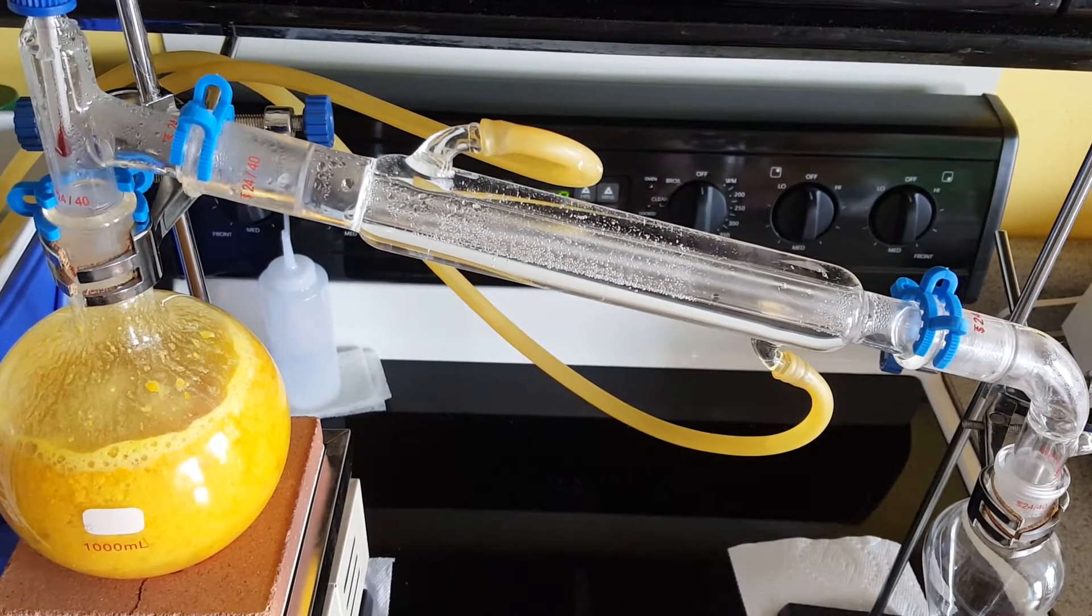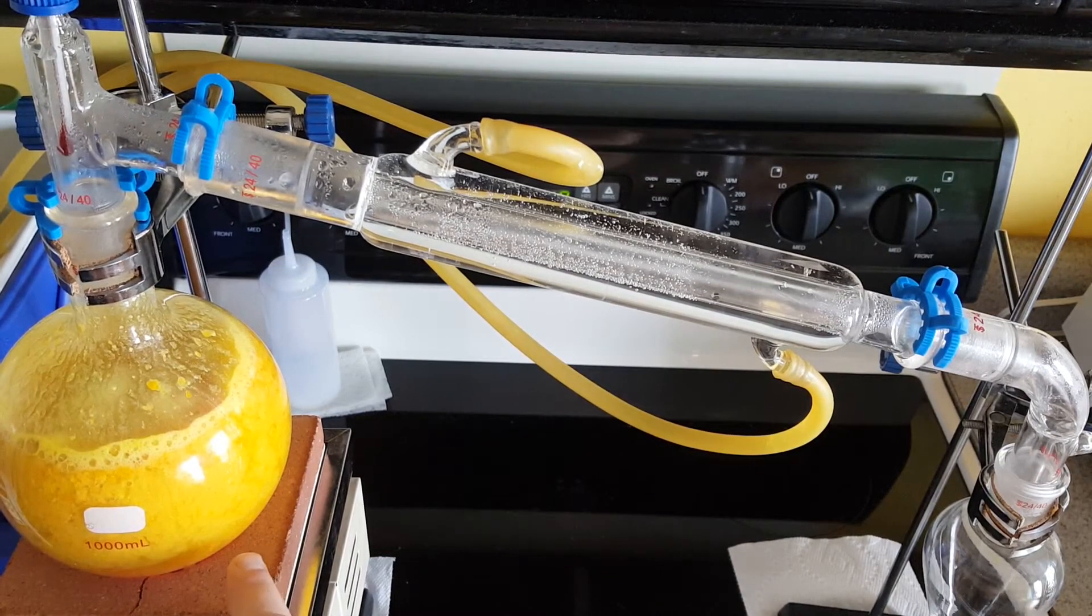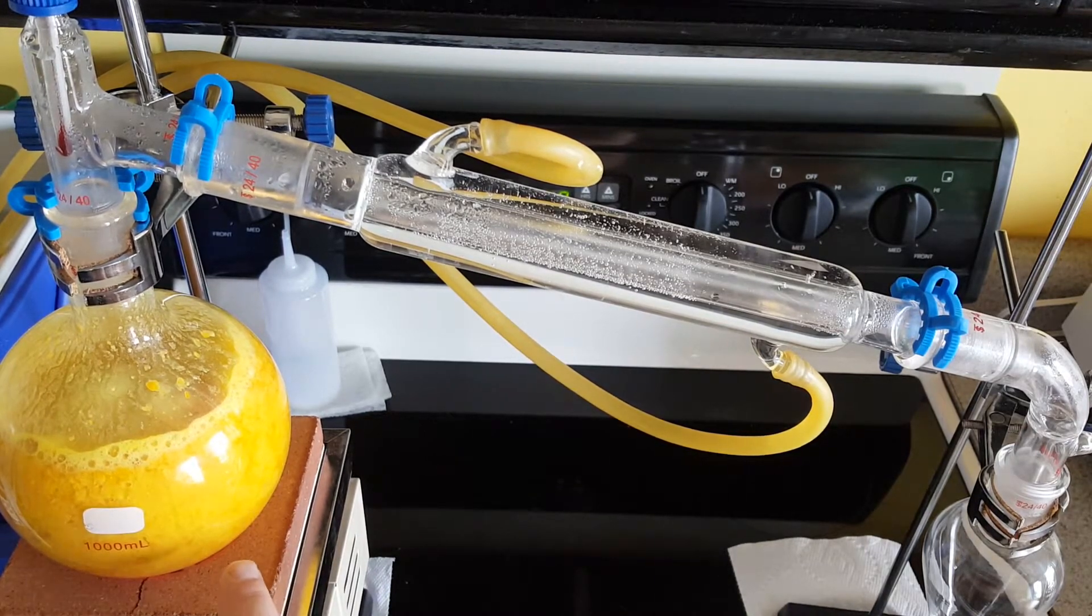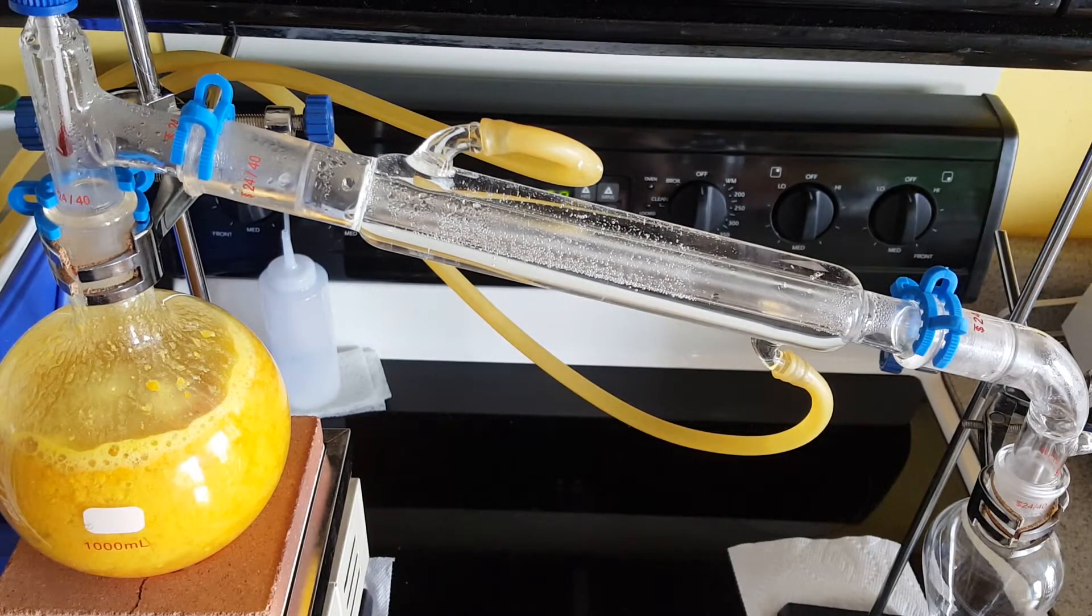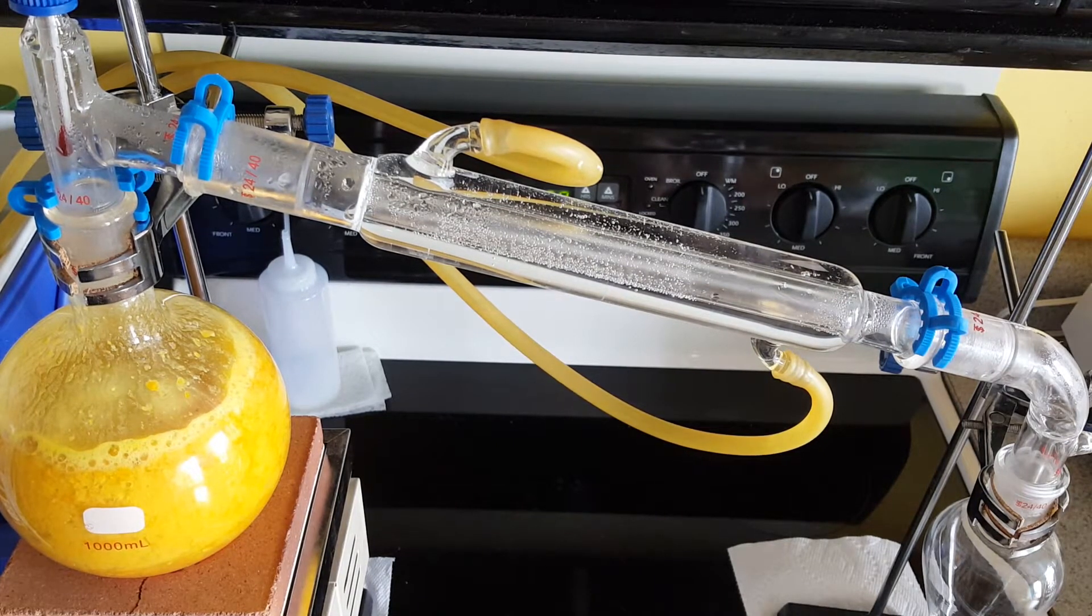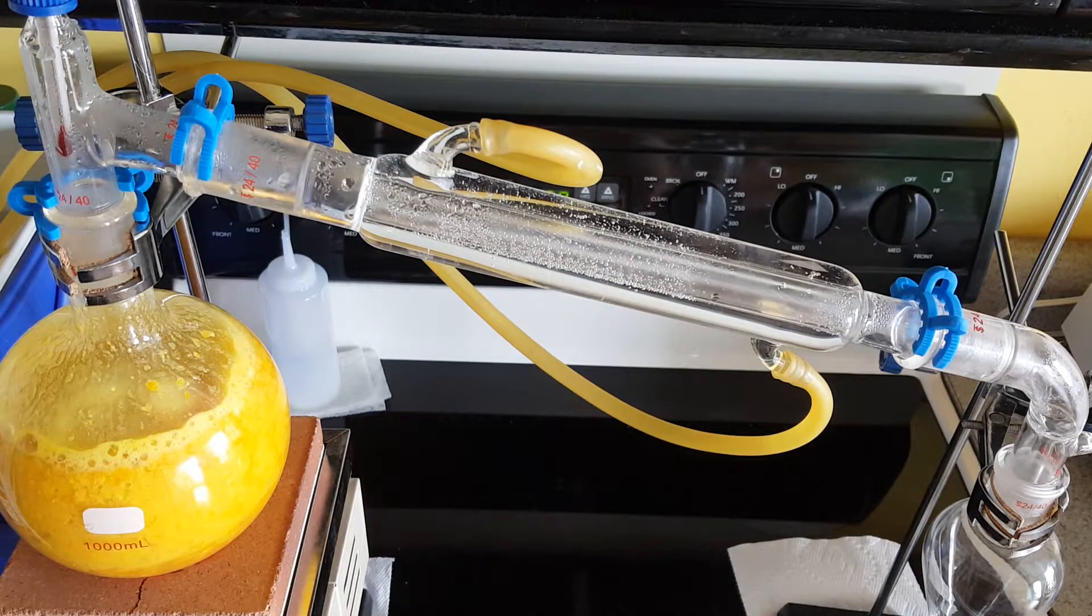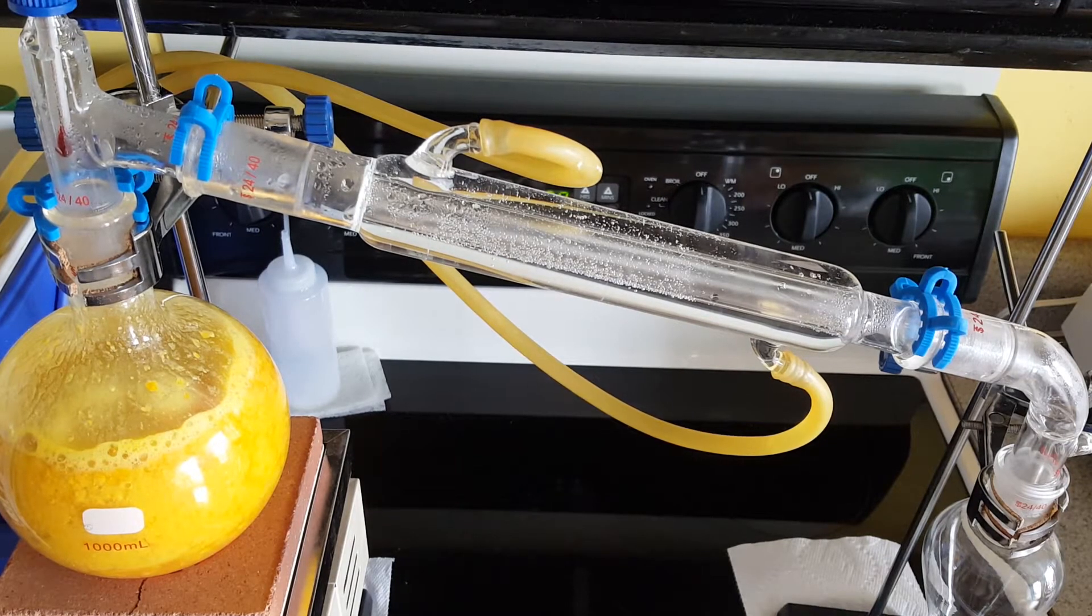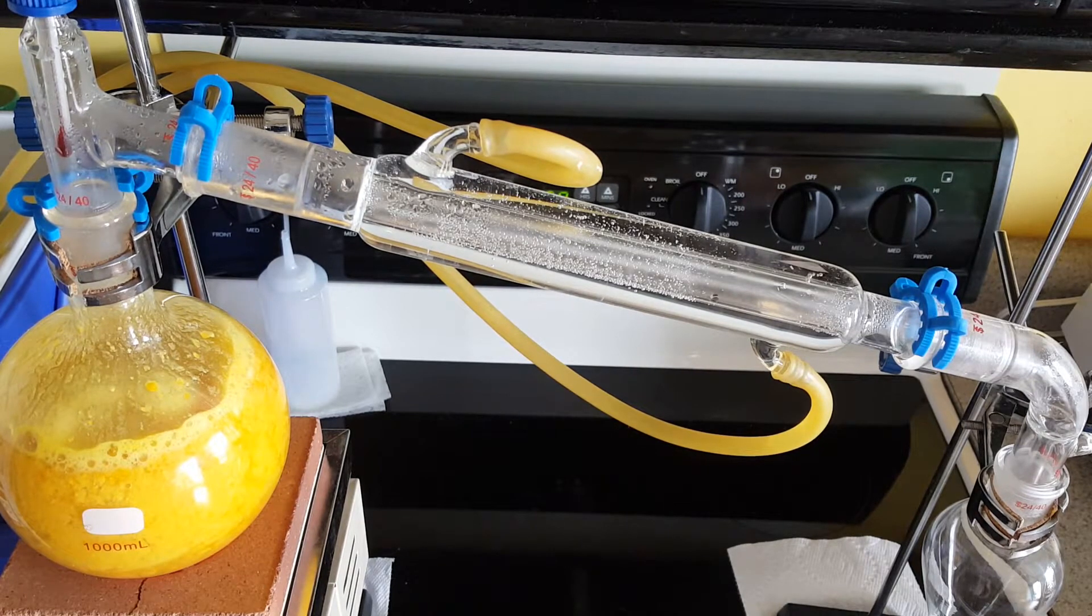For a while I saw bubbling going on on the bottom of my flask but the bubbles would just rise up a little bit and then disappear. I'm guessing the vapor that created the bubbles would cool down and liquefy. Now slowly I see some bubbles beginning to escape to the top and there's some motion in the flask as liquid flows up and down as it heats and cools down.